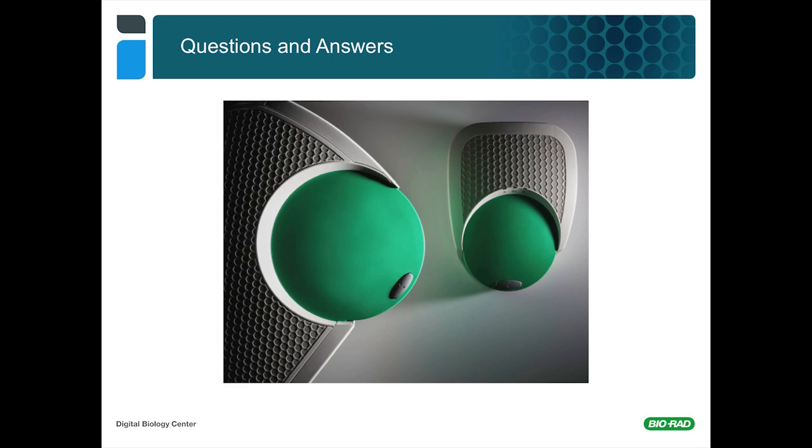So now moving to a question regarding the number of targets that can be analyzed at one time. How many targets can be analyzed, and does multiplexing decrease sensitivity? Okay, the answer on multiplexing is that yes, you can do multiplexing. Of course, I showed you duplexing in the two color channels, but you can also multiplex higher than that. I would say conceivably up to 4 is not inconvenient with the current system, and you do that by taking advantage of differences in amplitude of your clusters depending on the size of the amplicon.